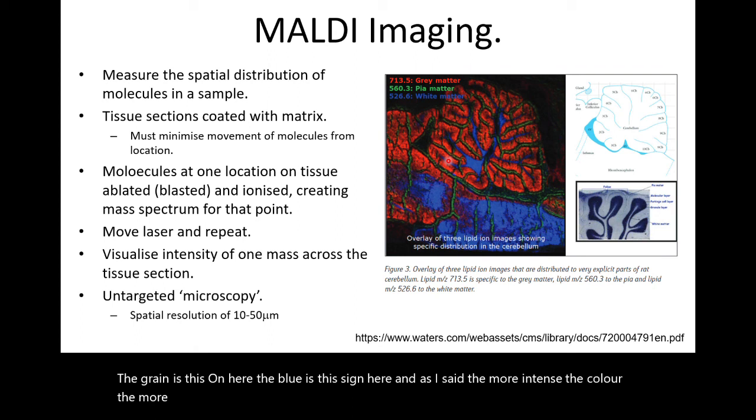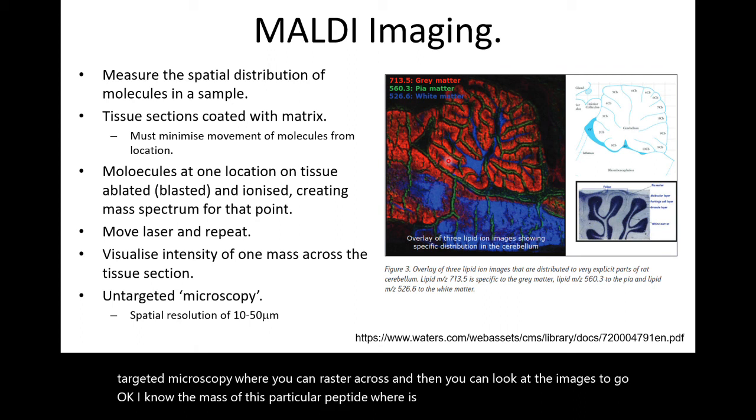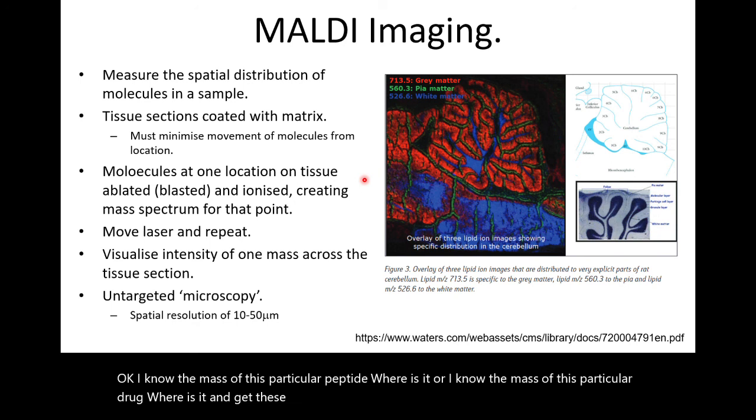So it's essentially doing untargeted microscopy, where you can raster across and then you can look at the images to go, okay, I know the mass of this particular peptide, where is it? Or I know the mass of this particular drug, where is it? And get these images that show you the spatial distribution of those molecules.